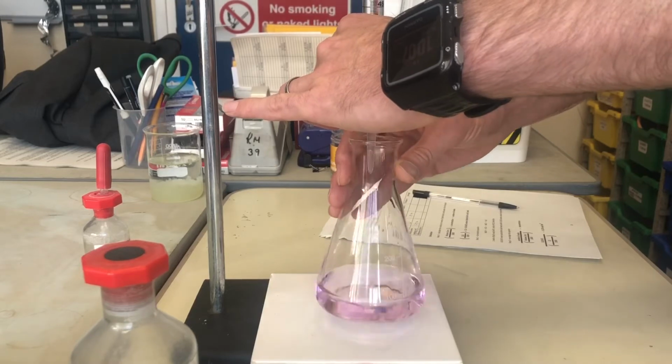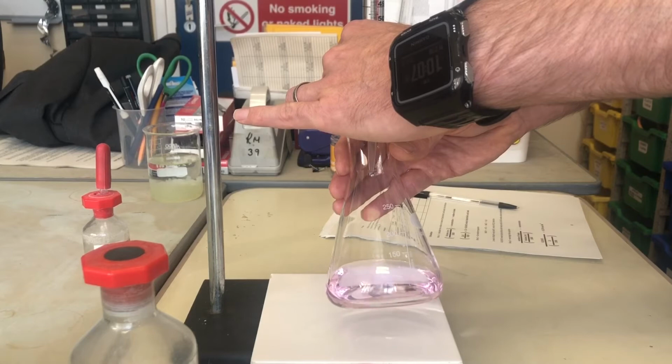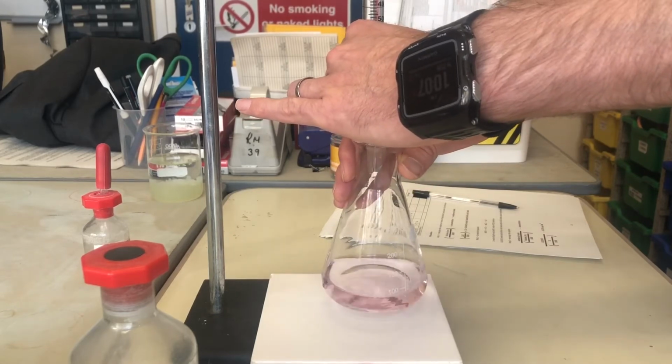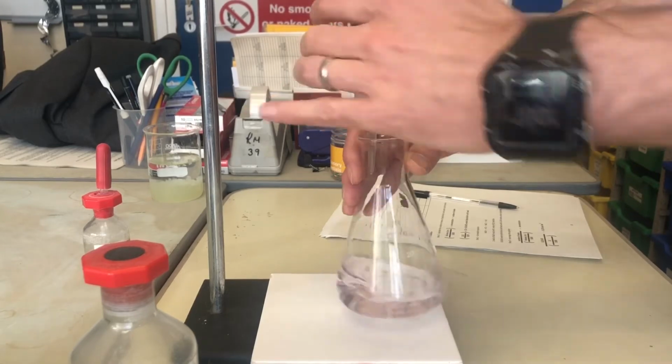I think our solution, maybe still a slight pink tinge to it. This is why the white tile is so useful, because it gives a contrast between the colour. So possibly just that one extra drop. Right, there we go, that's now neutral.